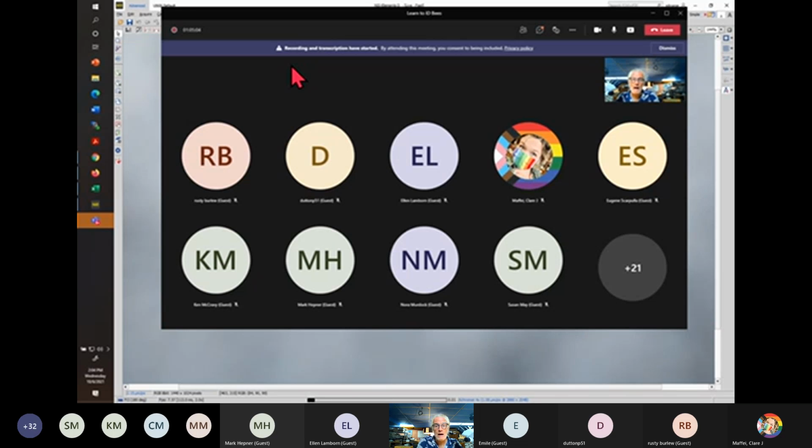And the really not way to go is to have everything in a unit tray and say, well, everything in this unit tray was from this collection event, and I want to keep it in that tray. When you're doing identifications, really what you want to do is take all your specimens and spread them out over big, let's call them boards or trays, and move them around a lot.